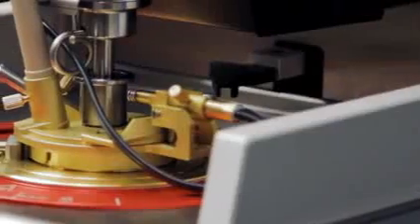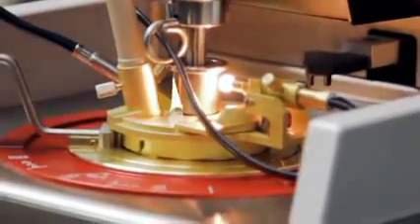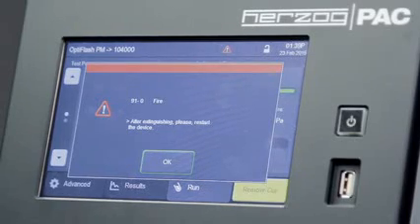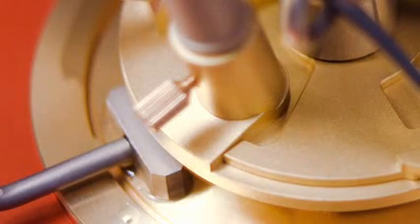When running a flashpoint test, it is possible for a flash to occur outside the test cup. When this happens, OptiFlash's safety monitoring system aborts the test and closes the shutter to eliminate the flame without activating the fire suppression system.